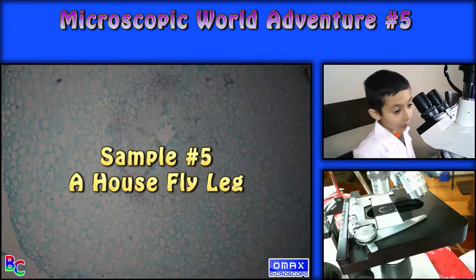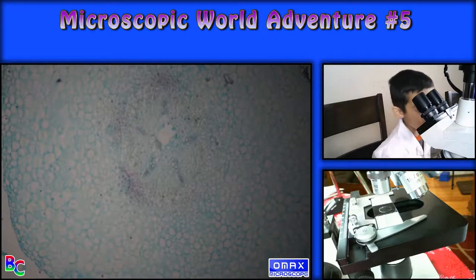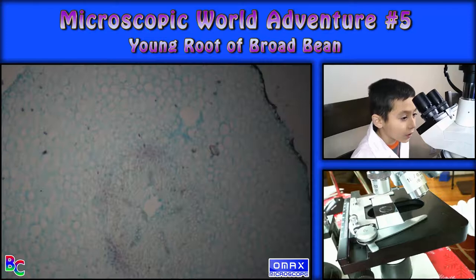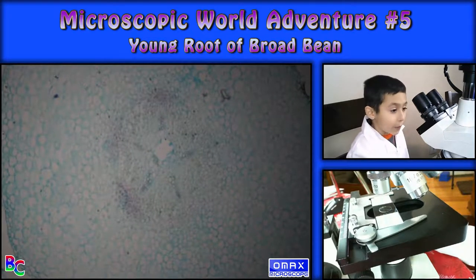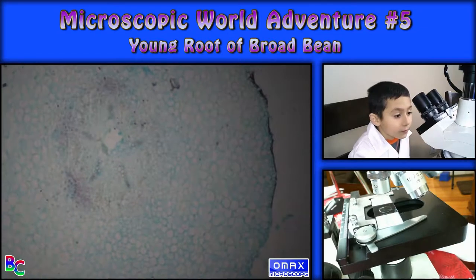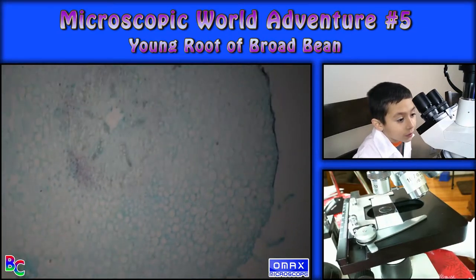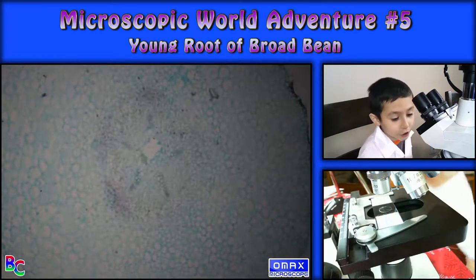I have no idea how these look except for young root of broad bean because it's already on. So this is young roots of broad bean. It has like this black line — I don't know why — and lots of texture.